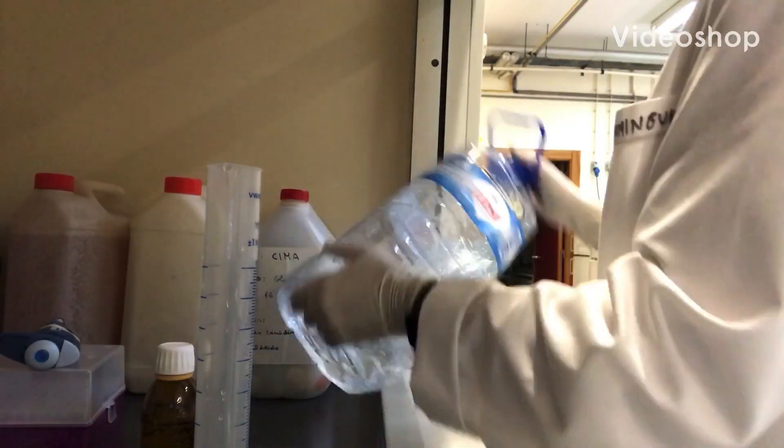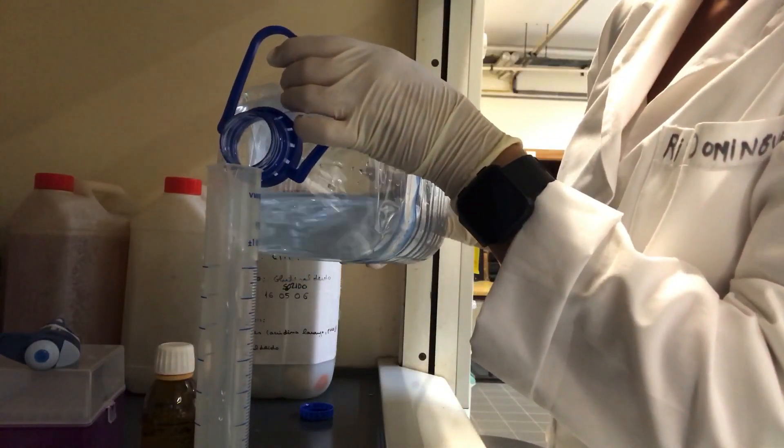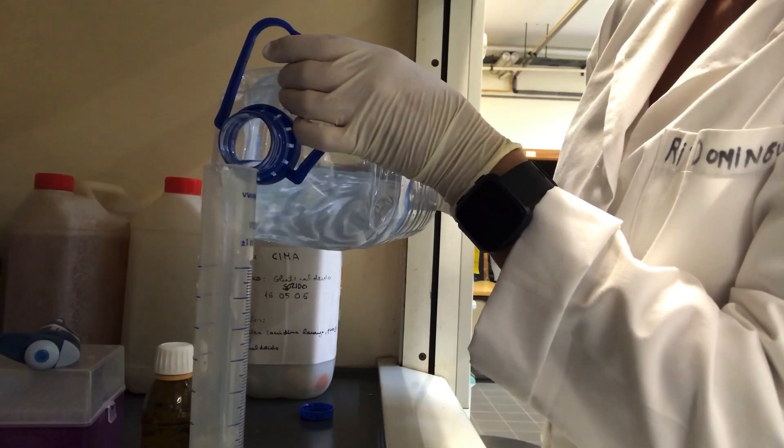To preserve a water sample for epifluorescence microscopy, measure 50 milliliters of sample and place it inside a dark glass flask.